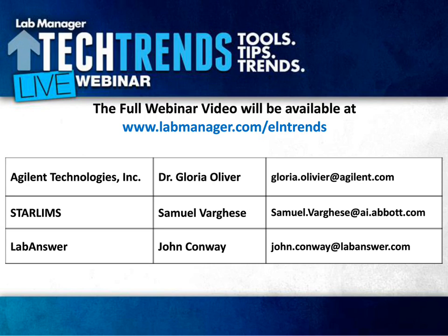Sam? Yeah, and so I would say that, with our customers, with the LIMS, you've got the whole process that you're passing through the lab. You're logging the test samples in, you're running the tests, you're recording the results, you're reporting the results out. But as you go through that process, there's also interim data that you would typically capture in a paper notebook, or you may generate some Excel spreadsheets or whatever it is.